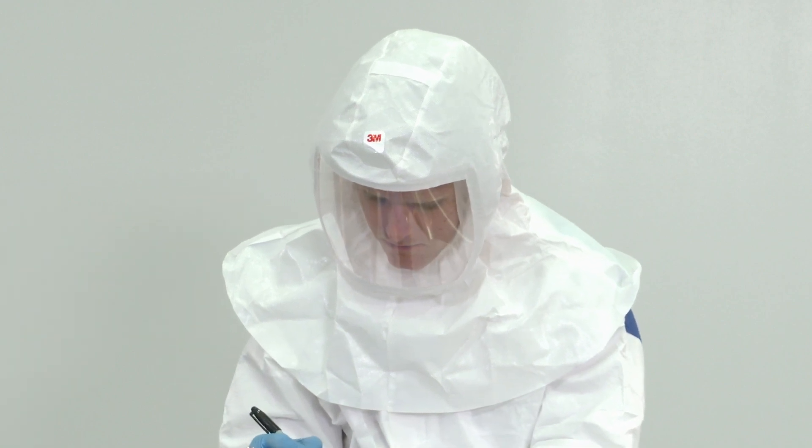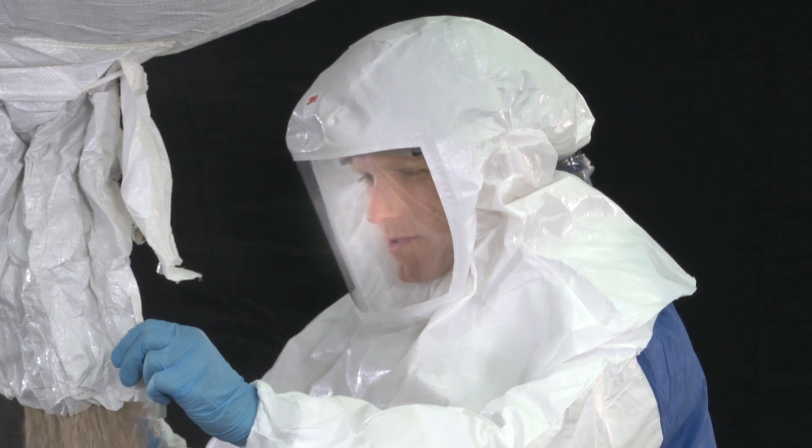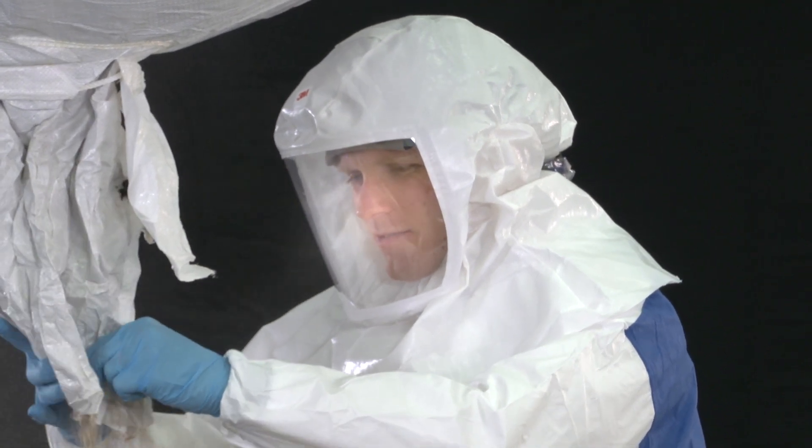The disposable hood features adjustable head suspension and provides head, face, neck, and shoulder coverage.